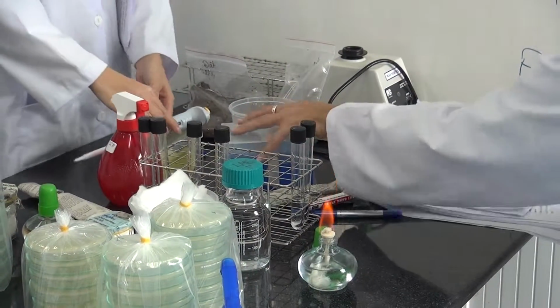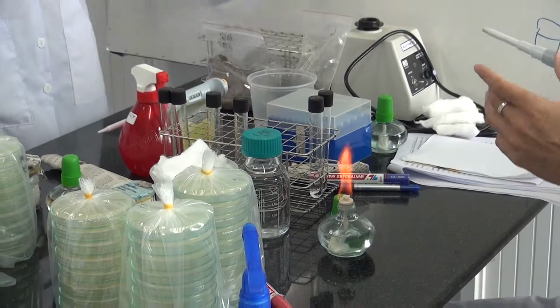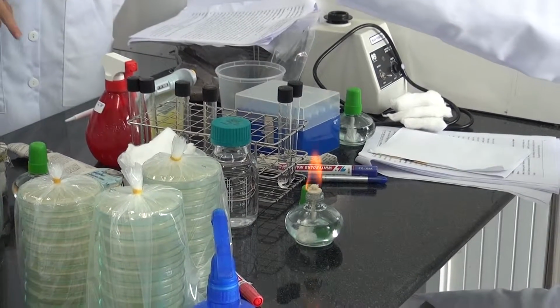Okay, so usually in microbiology labs today you use this type of machine that is there, this sterile hood.